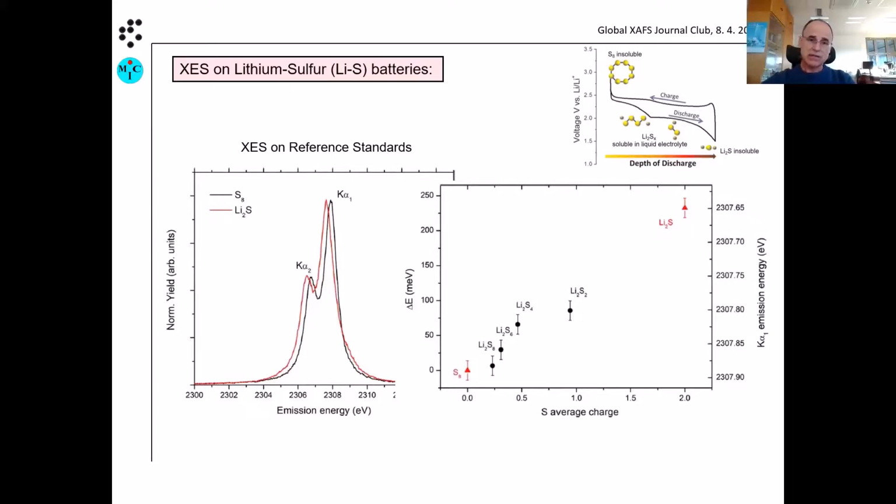You are speaking about 100 meV. So it's difficult to measure this. You need good precision and reproducibility, but it's there. We have done this many times over and over, and it is really systematic. So this looks reasonable. You can measure this.